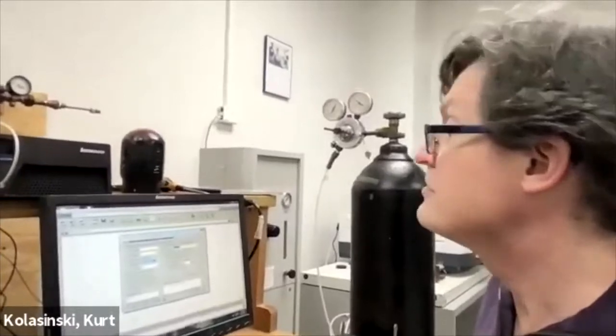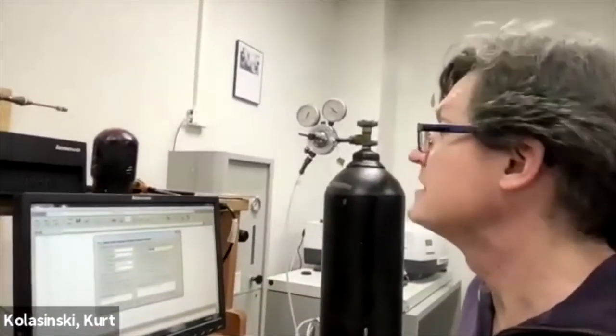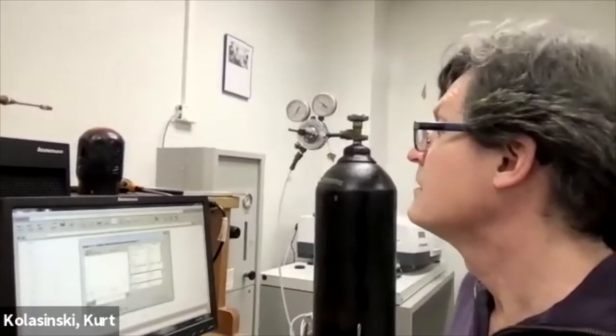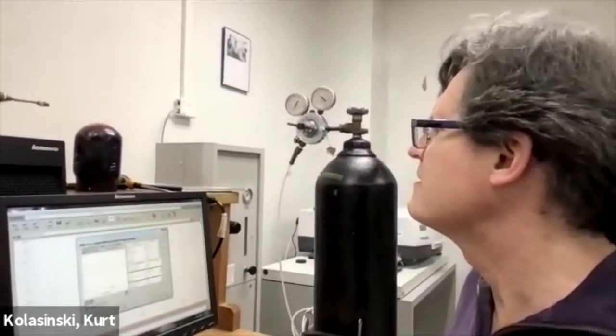And then over here, you can tell it whether it has to collect a background now, before the scan, or if it's from a particular file. For that high resolution one, we're going to use that one particular file, right? So we set that. Then in the second tab over, bench, check it out. We've got that KBr beam splitter and the IR source.